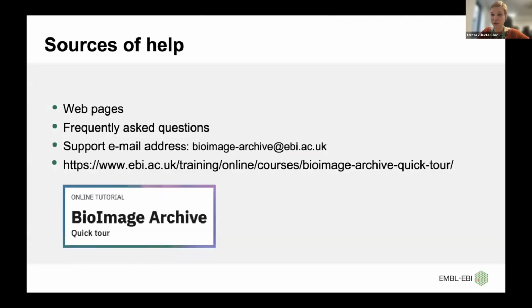So this was a very brief overview, but we have lots of sources of help if you have any questions. I want to highlight our support email address. We love hearing from our users for questions or for feedback. And also, Ibuke has put together this wonderful online tutorial that I highly recommend if you want to learn more about the BioImage Archive.